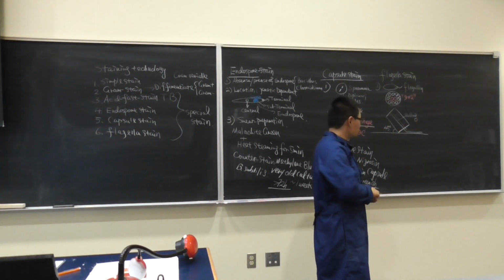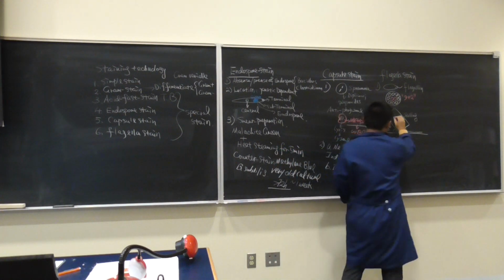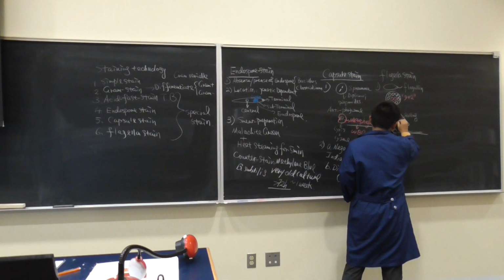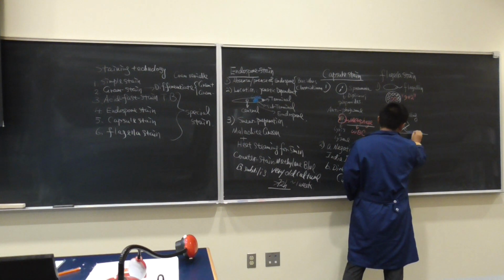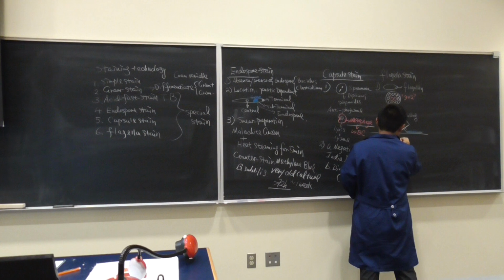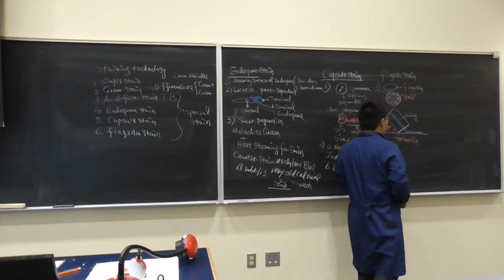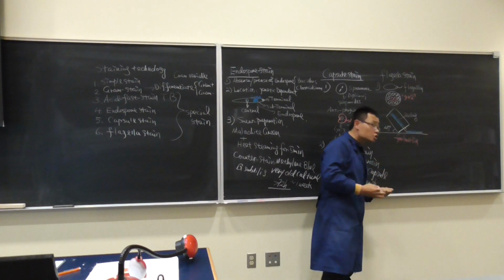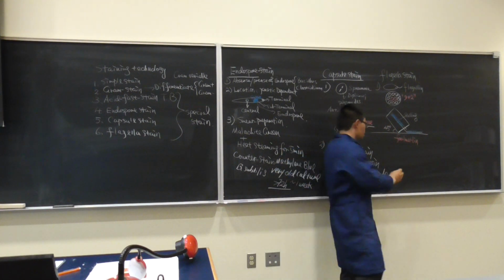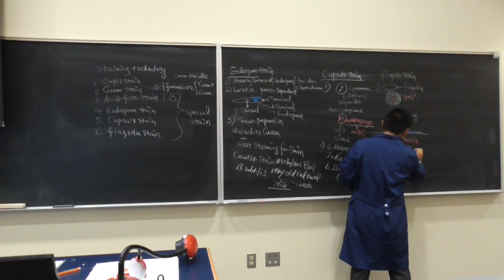Once it rolls, first of all, we have to fix it. So we have to do some fixing. What are we going to use for fixing? Formalin. So use formalin to do the fixing. And then we need to make sure it is coated, so we add tannic acid to do the coating.